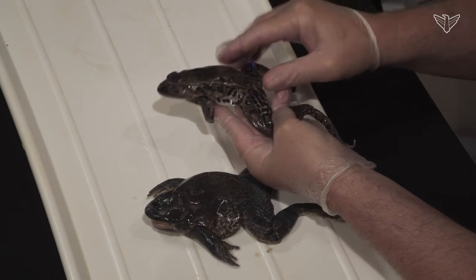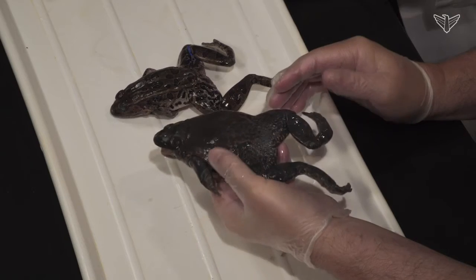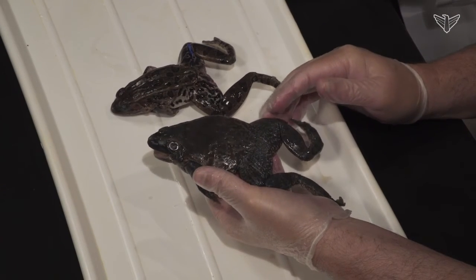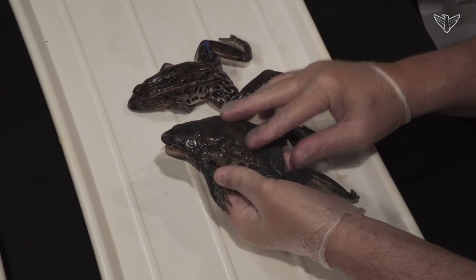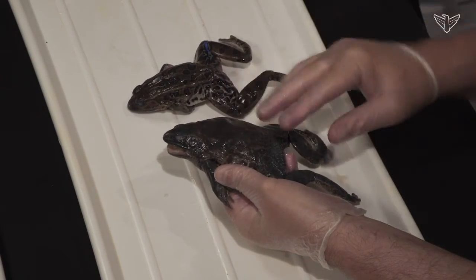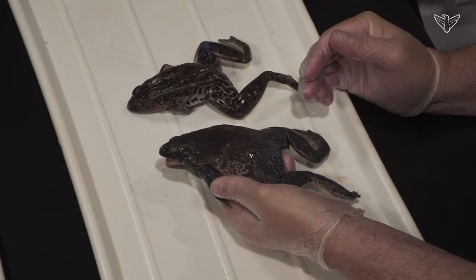So they're a little smaller, and from most supply houses you can also get bullfrogs, which are larger frogs. They might be easier to see things on, but they're more expensive. So you have to balance which one you want to use. Maybe one for display, or it depends on your budget.